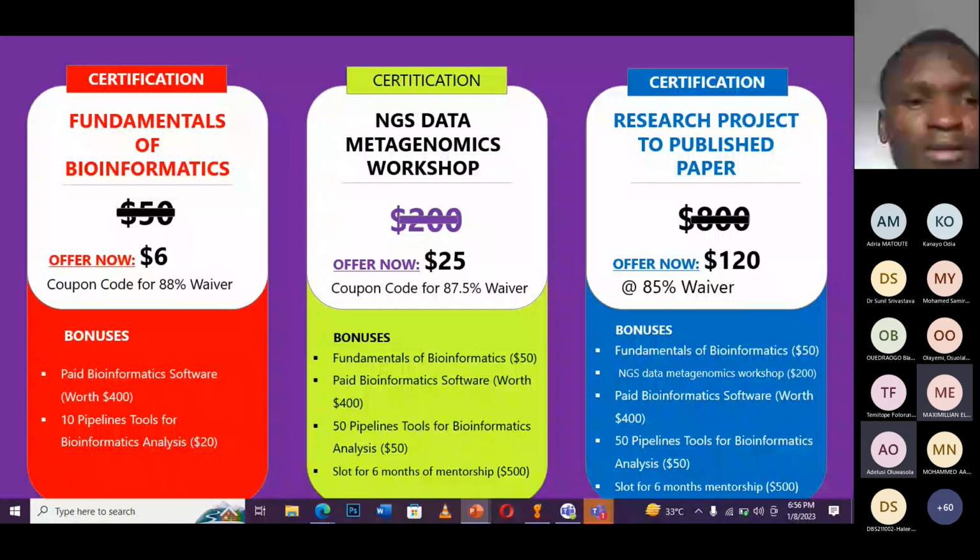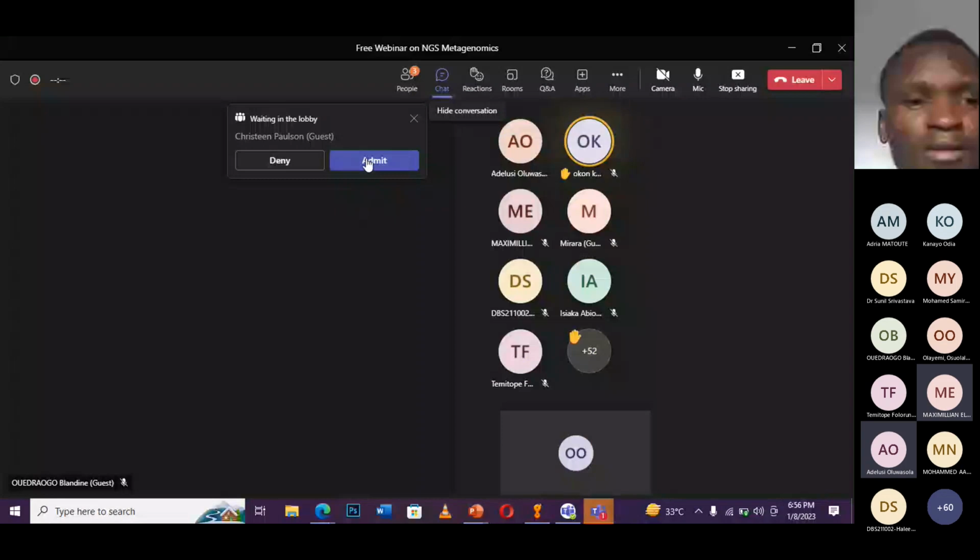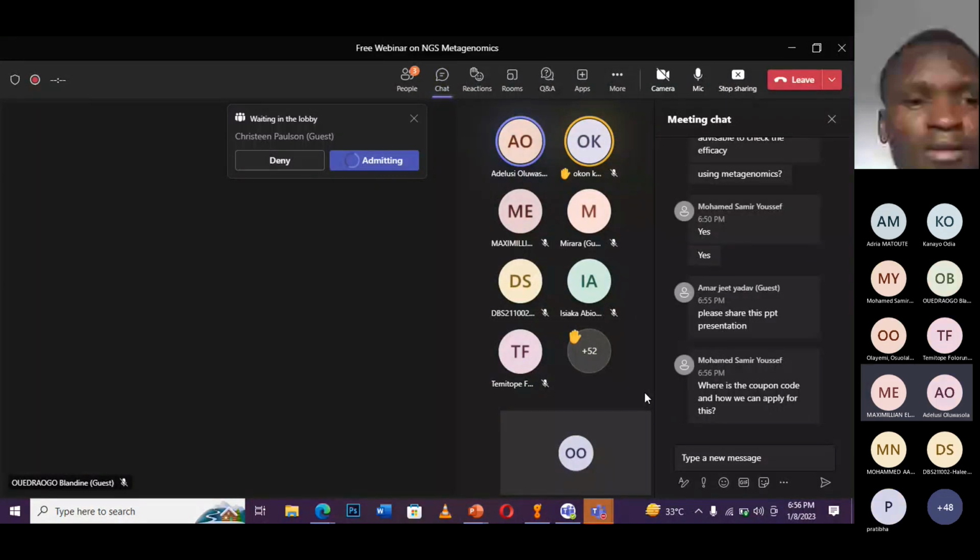All right, fine. Then regarding my question, I've been silent this morning, so I just have 2 or 3 questions, please. Regarding metagenomics and the sampling and DNA extraction, are we just going to do the analysis from the sample, or do we need to extract the DNA?